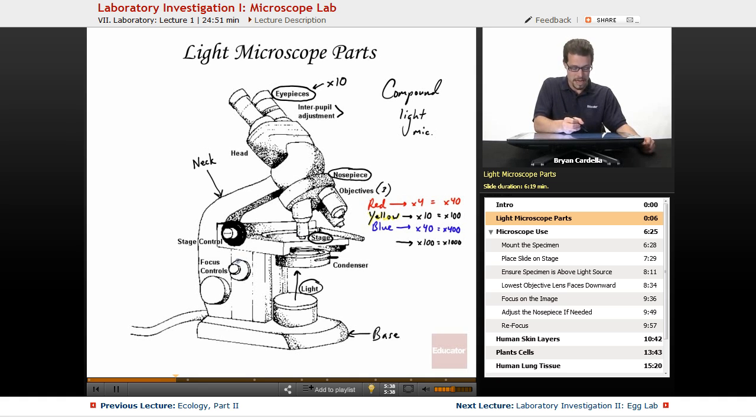When you're focusing later in this lesson, I'll give you instructions about how to specifically use these parts. When the focus controls are being used, you start with this. This is called the coarse focus. That big one is the coarse focus and this one is the fine focus. So you move the coarse focus first. That's when it actually moves the stage up and down. So while you're looking through the eyepiece, you move the stage up and down until it becomes clear. Then you can make it even extra crisp by moving that fine focus.